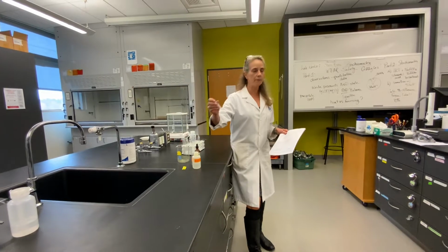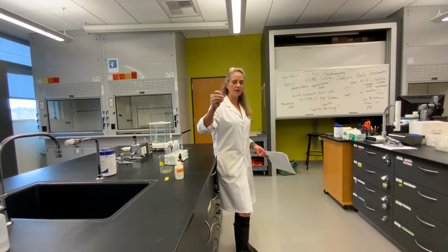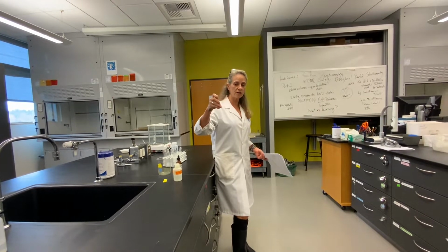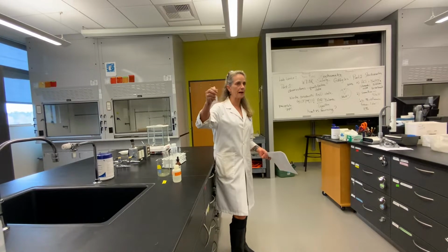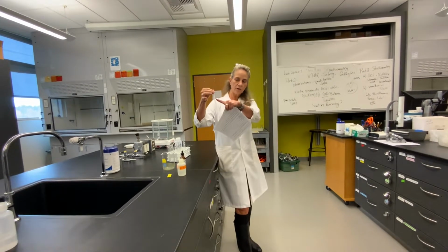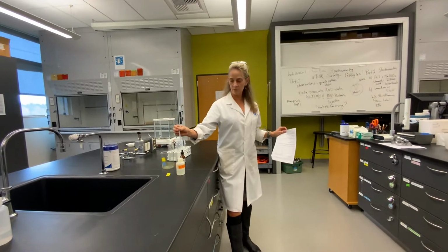And I want you guys to remember, these are graduated pipettes, and this one I think is a 2 ml capacity. So it's always a very important thing to do when you walk up to the pipette, you wanna make sure you know what the volume is. What are the graduations, so that you don't add twice as much reagent as you need to. So about 1 ml, I want you to practice, right? Squeeze the bulb, stick it in the liquid, let go. It comes all the way up the bulb, and then you squeeze it down to the volume that you want. So practice that, okay? So that's how that goes, and I'm gonna ask again about contamination, so be really mindful.